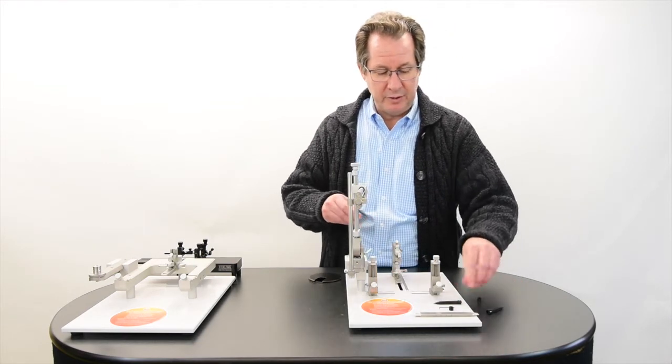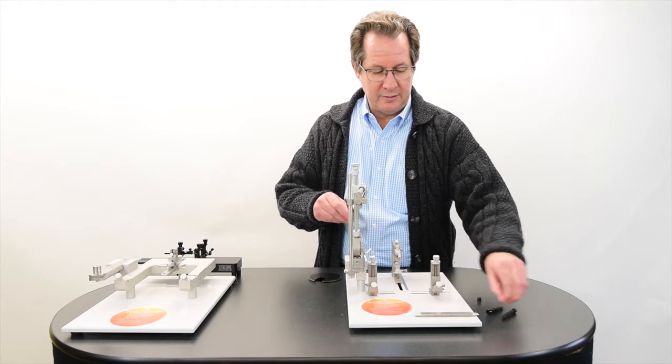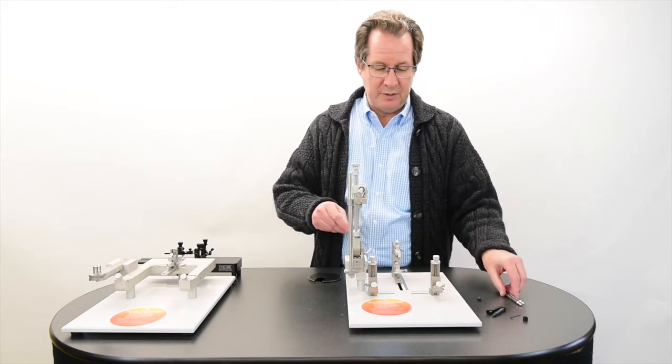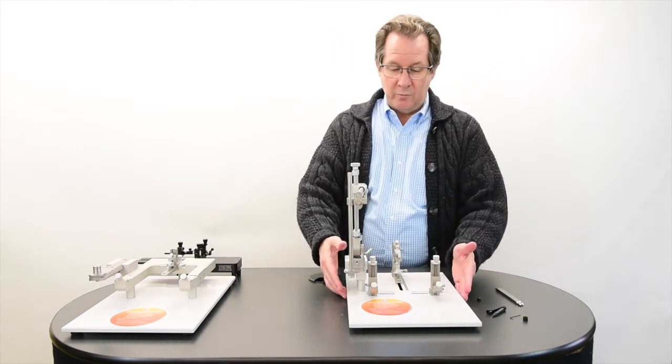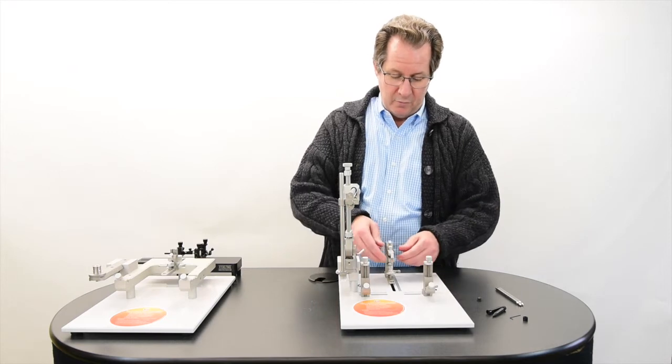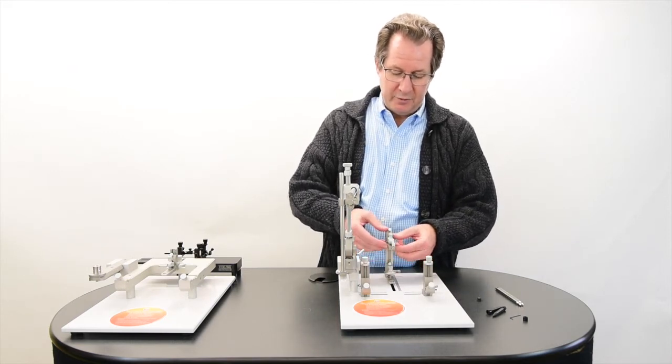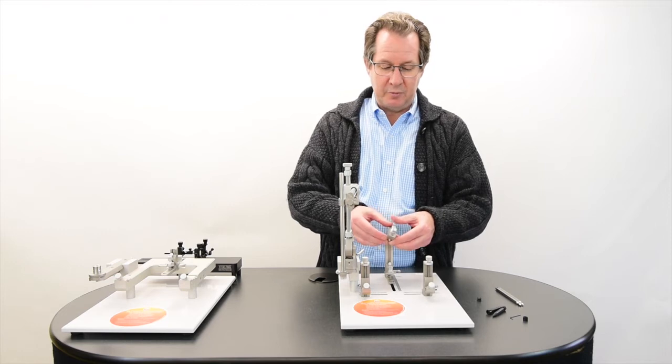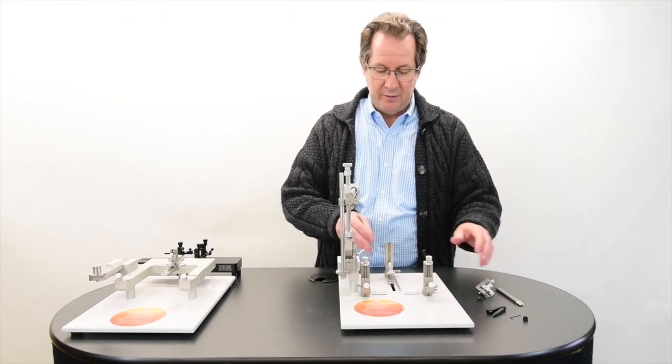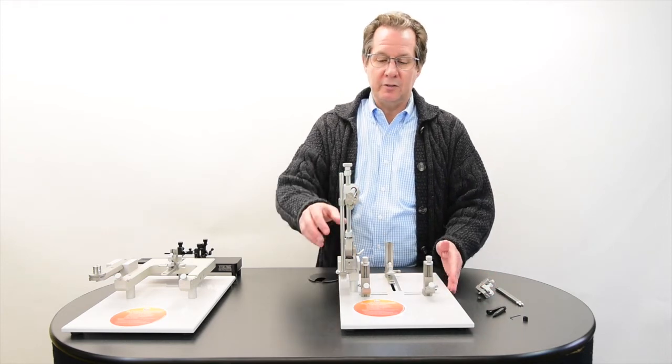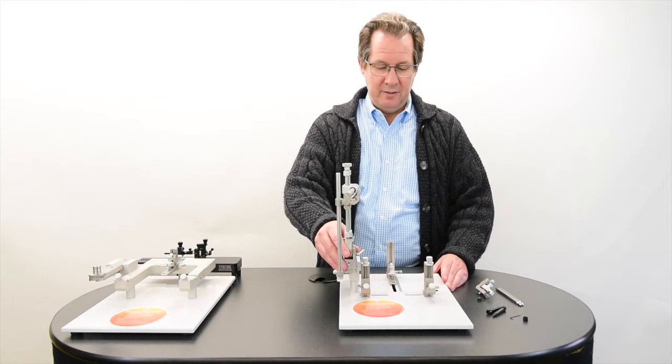Now I just want to briefly give you a little introduction as to the function of this particular unit. So right now we have it set up for rat. I'm going to remove one of the adapters. This is the mouse adapter part. Set that aside for now, and this would be the configuration for a rat. And you will notice that I have the vertical posts all the way to the side.